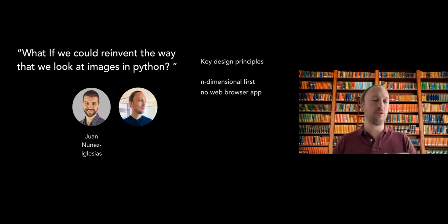Not a web browser app, because we really felt that we wanted something that didn't have the indirection and the layering of a browser. We wanted a first-class application, or at least something that felt immediately accessible. We wanted something really fast, so GPU acceleration was definitely a must for us, and especially for me, because I had worked with ClearVolume and I knew that you could get a lot of performance there.